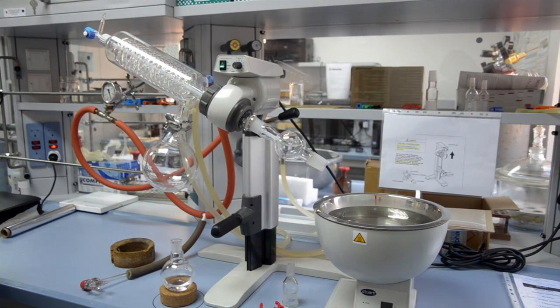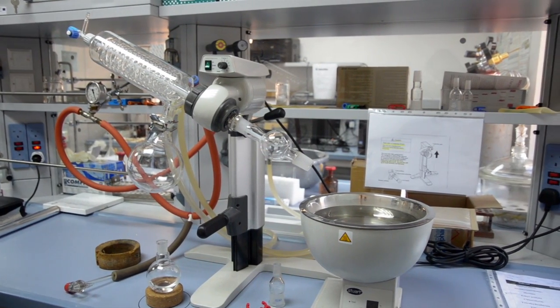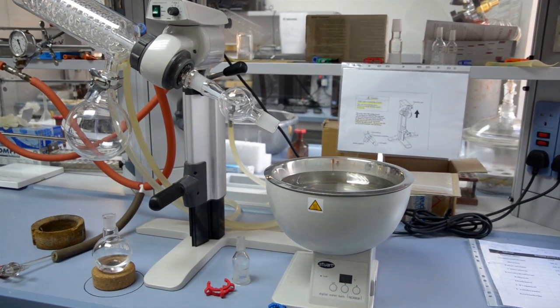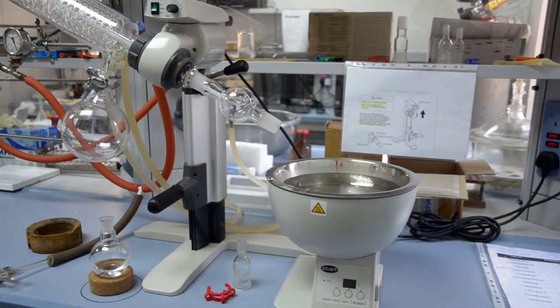The Splash Guard. This prevents excessive backflow of condensing solvent and protects the apparatus internals from any accidental splashing from the reaction flask.